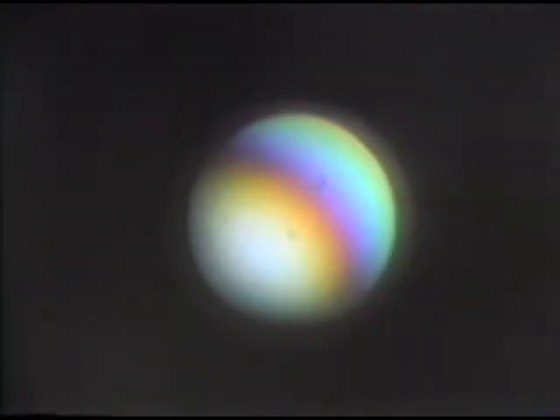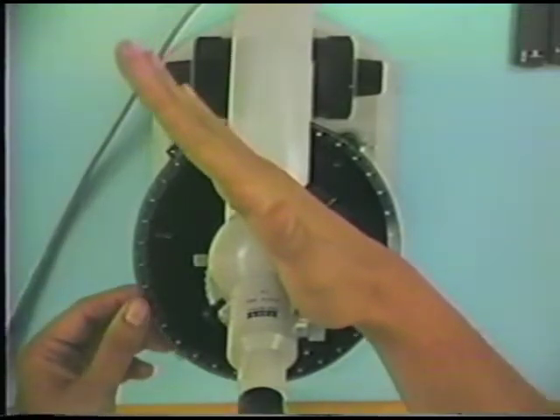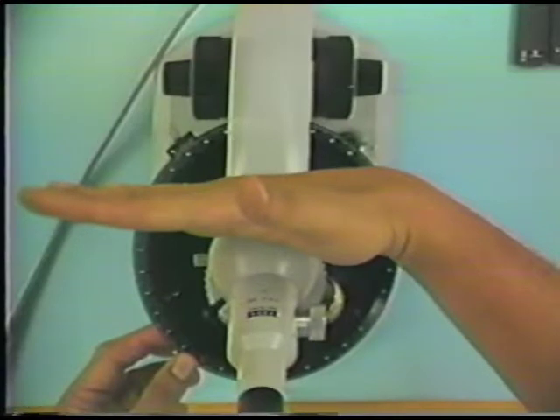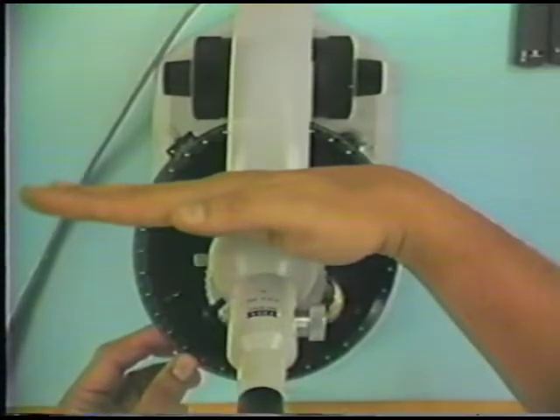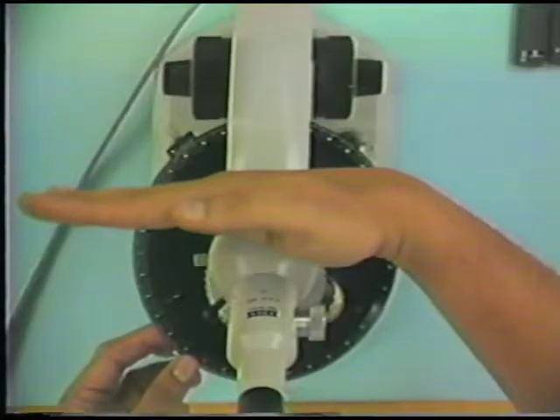So at this point I want to take out the Bertrand lens and the converging lens and simply rotate the stage back this way, and now I'm ready to measure the O ray exclusively in an uncentered figure. So that's the orientation procedure using an uncentered figure.